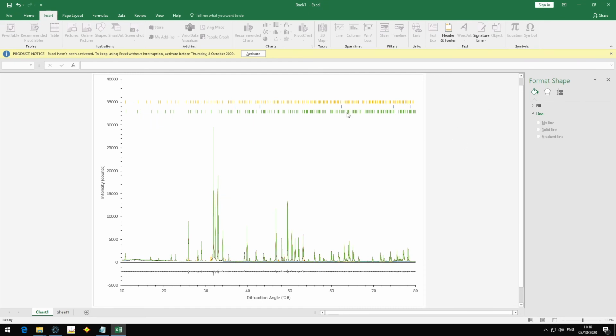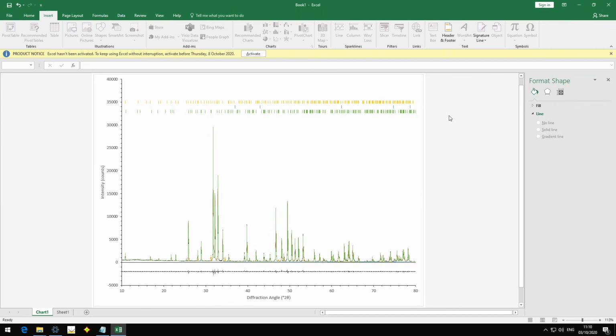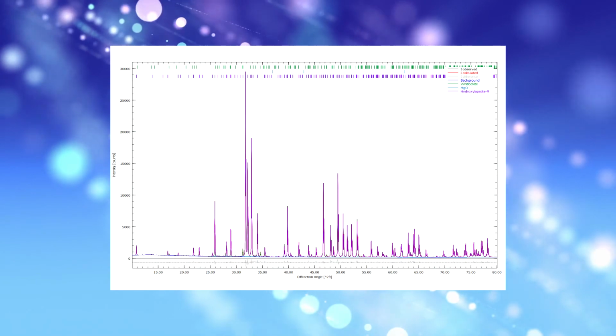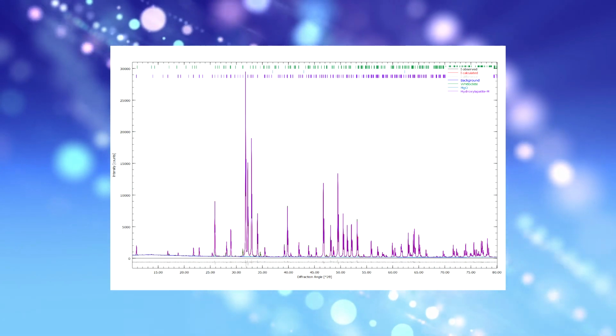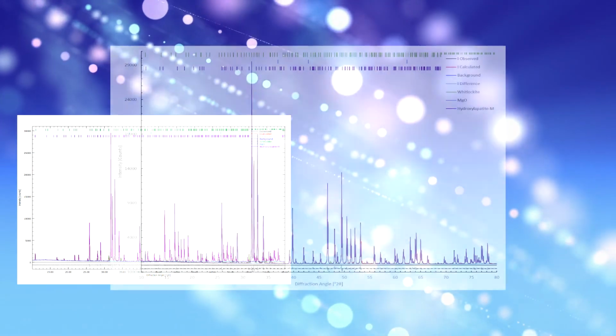I'm not sure if pasting the vertical lines to the markers will be the same. As far as I remember, if you use Origin, they already have a vertical line as a marker option, so you simply select this as a symbol for markers and you're done. Origin is actually a very good solution for drawing graphs like this. They look quite nice by default.